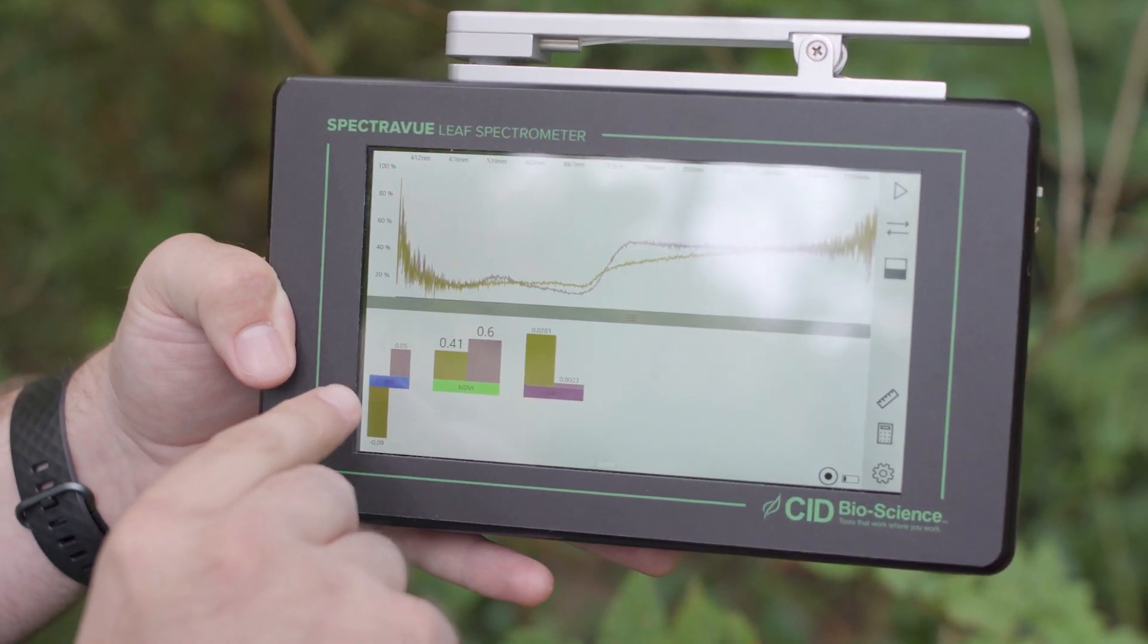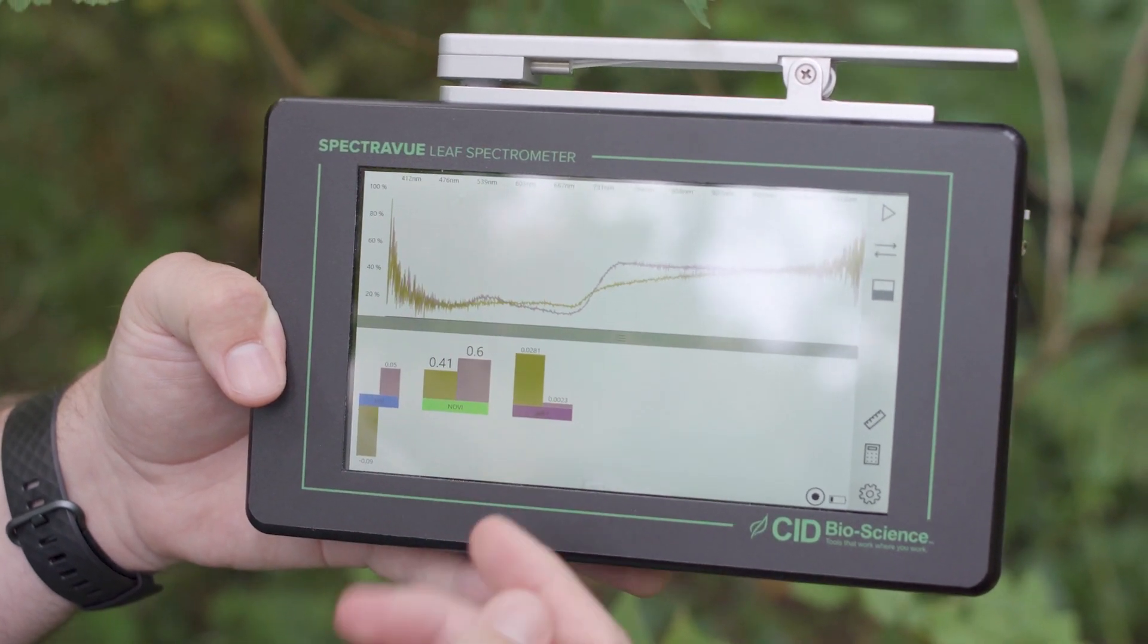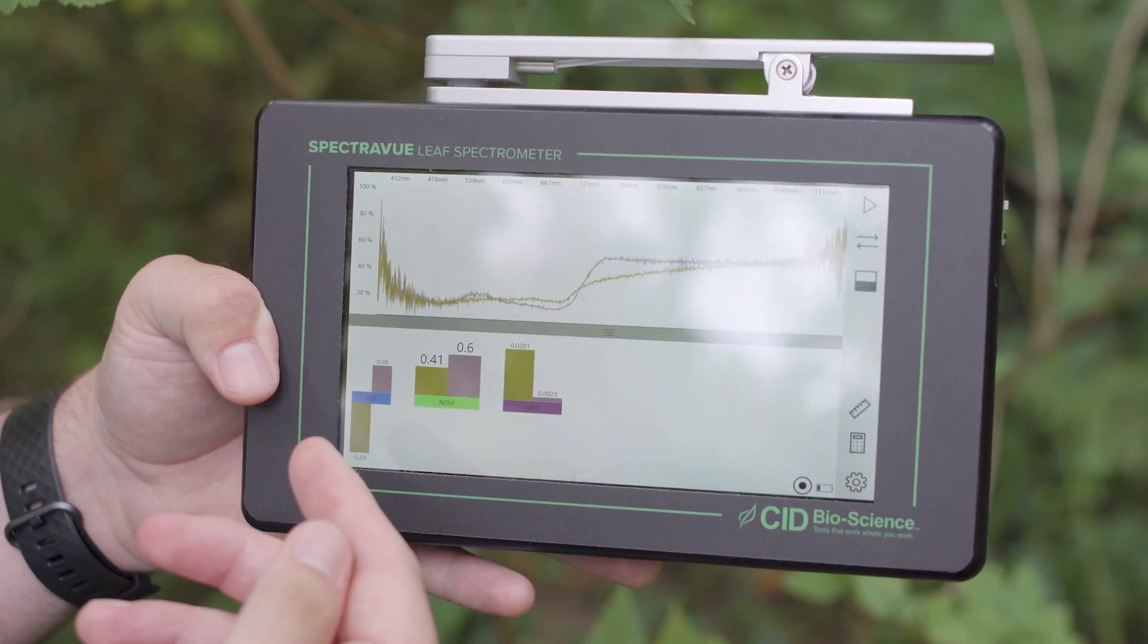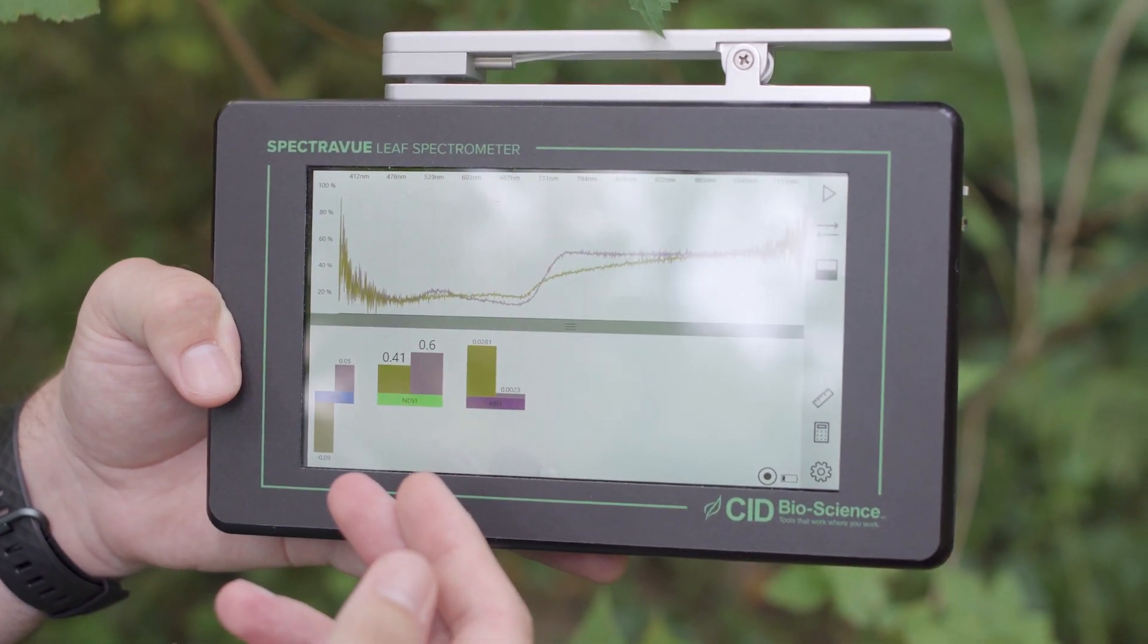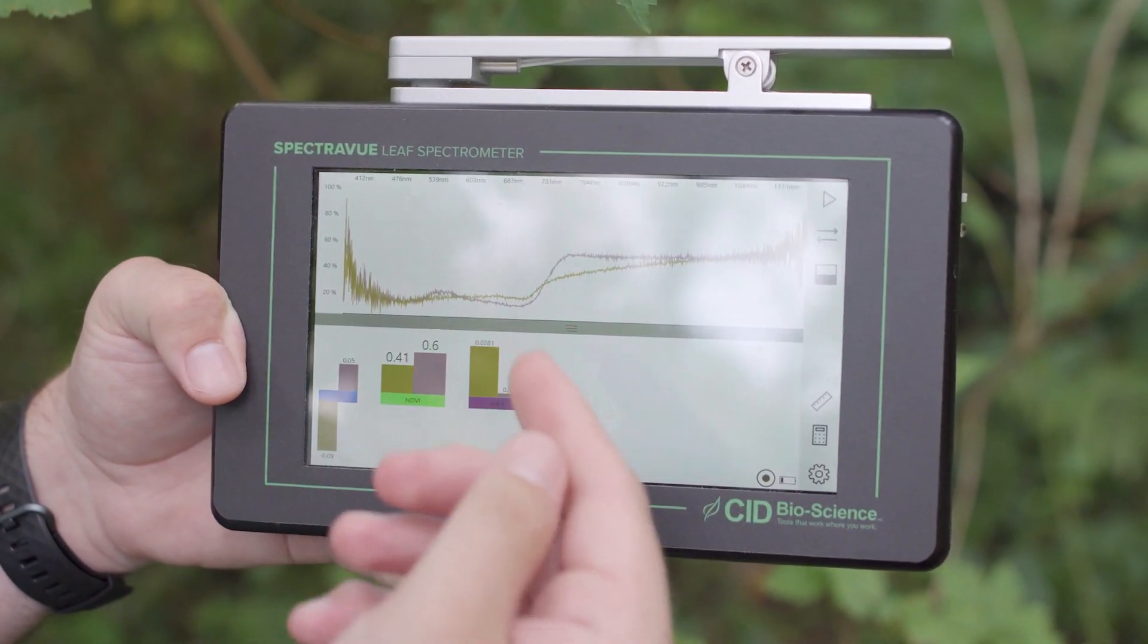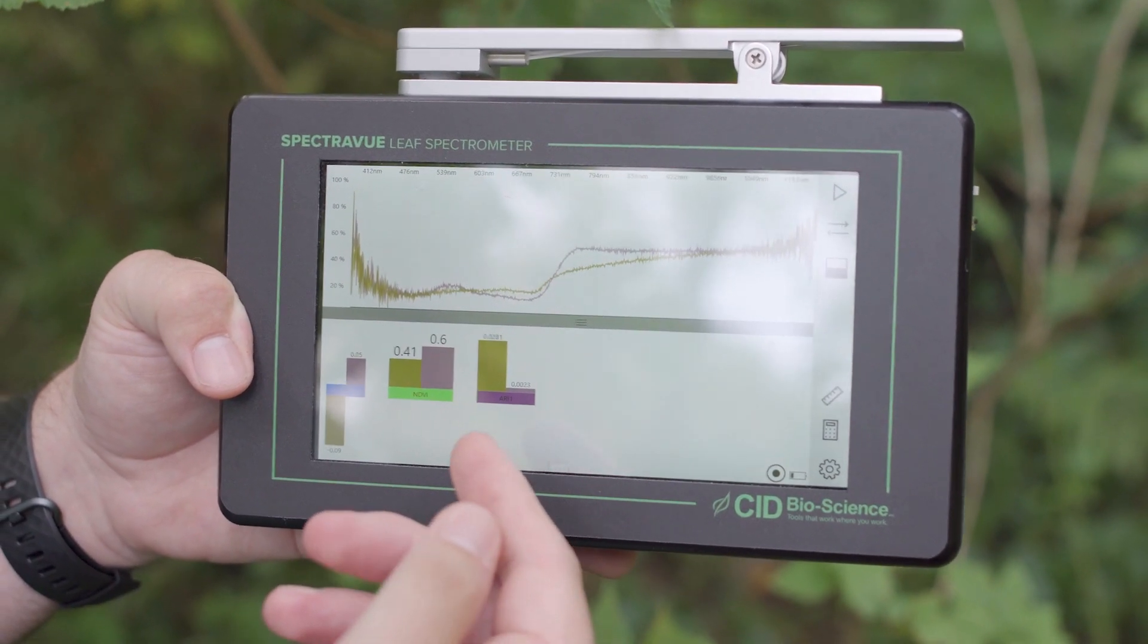So down here I have the PRI, the NDVI, and the AR1. These indicate the PRI is the photochemical reflectance index, the NDVI is the normalized difference vegetation index, and the AR1 is the anthocyanin reflectance index.